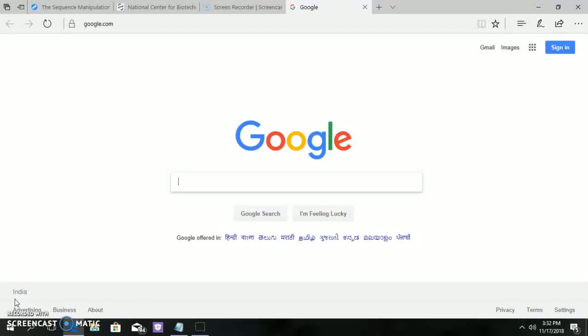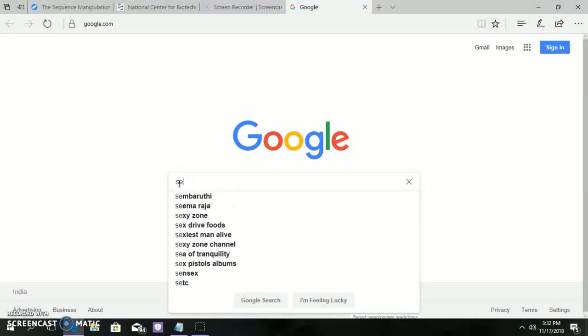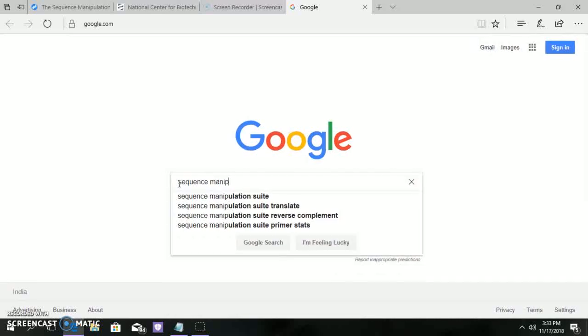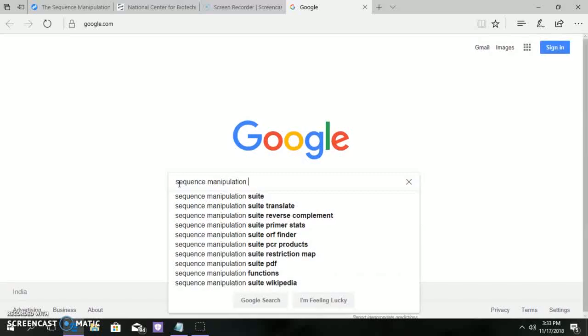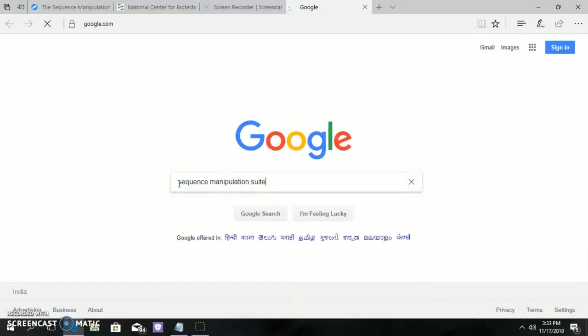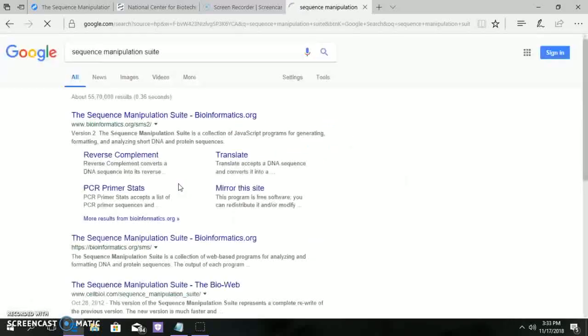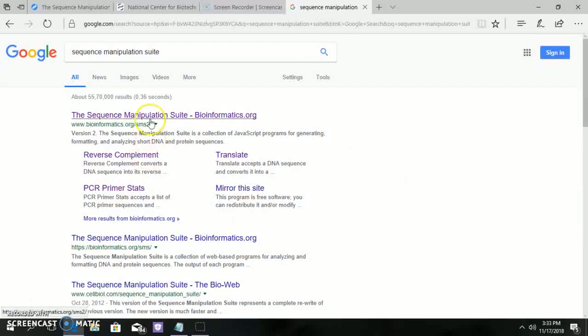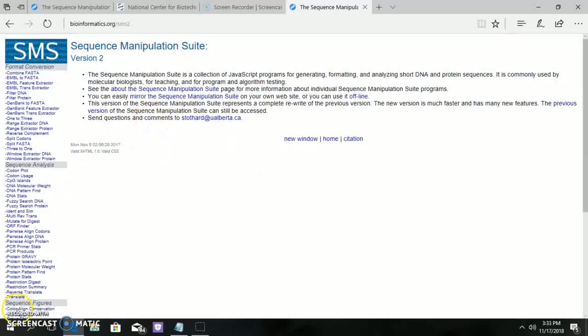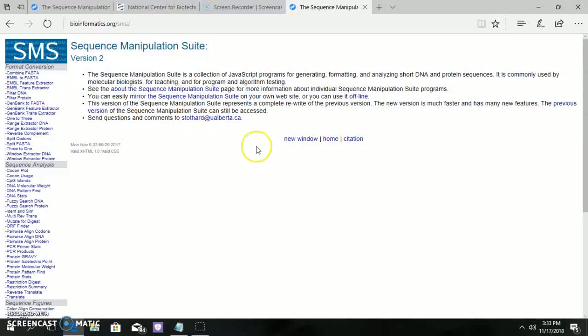First, go to internet and type Sequence Manipulation Suite. This tool is available both online and offline. This is the home page of Sequence Manipulation Suite.